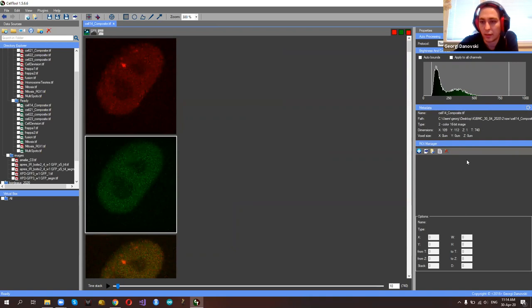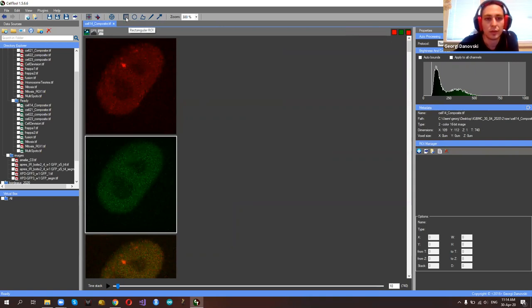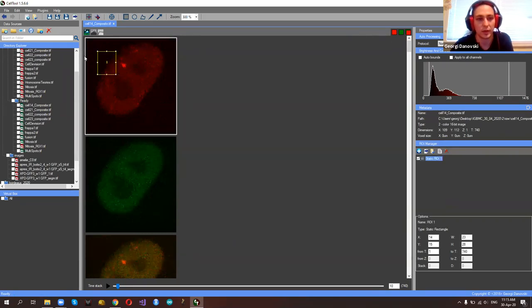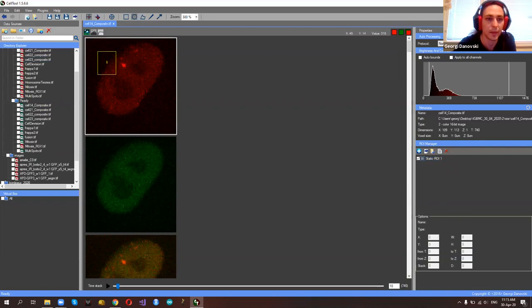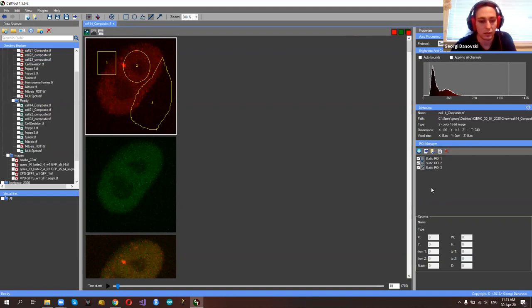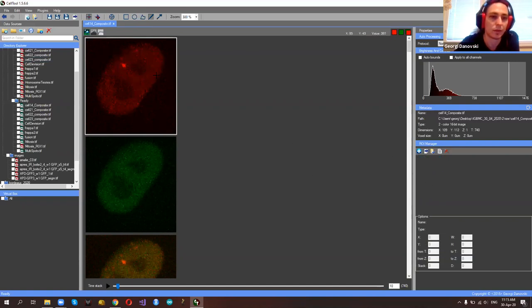Below the metadata, you can see the ROI manager. The shape of the ROI can be changed from the menu: you can choose between rectangular, oval, polygonal, freehand, and magic wand. You can add the ROI to the ROI manager by pressing Ctrl+T or the plus button. These are the commonly used ROI shapes for measurements.